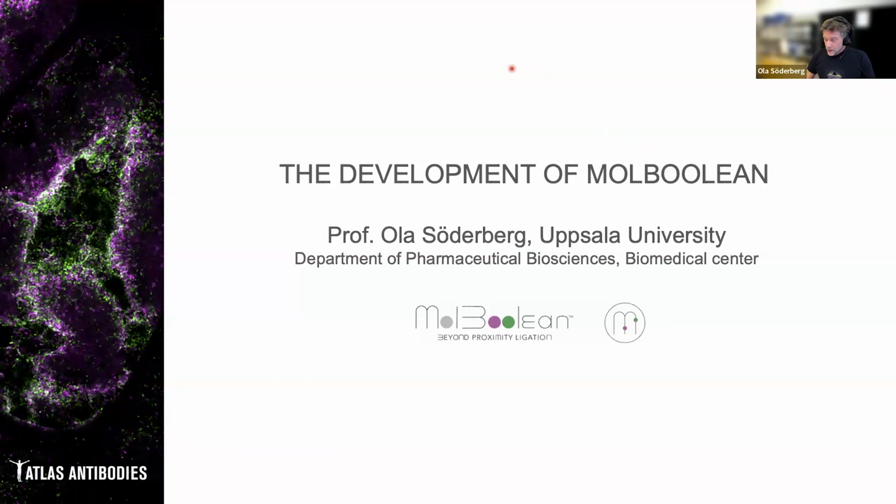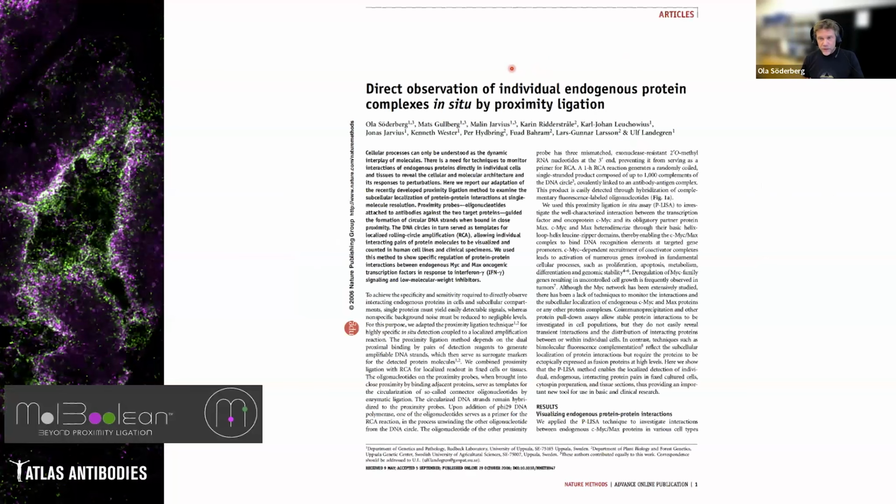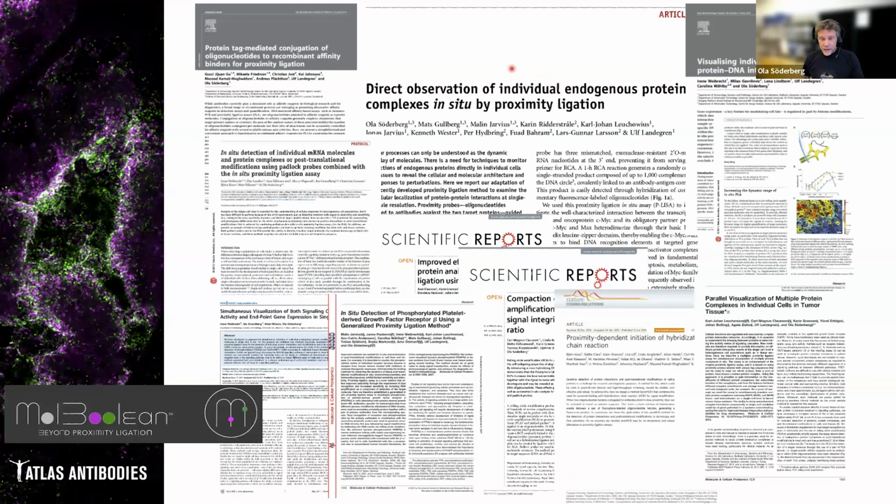So I have been working with method development for many years. I joined Ulf Landegren's group almost 20 years ago, and then we have been developing many different methods like the in situ proximity ligation assay and many variants thereof. This is how I spent the last 20 years of my research activity. I started in the beginning as a tumor biologist, working with leukemia, and I saw the need for better methods to look at protein interactions to understand signal transduction.